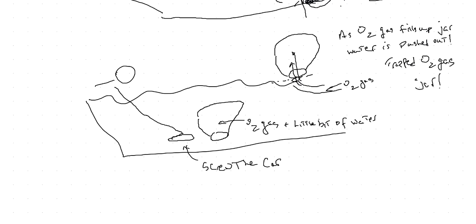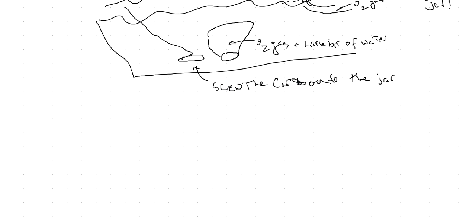Then we turn it back up, and take it out of the water, out of the trough. And we do this 3 times.